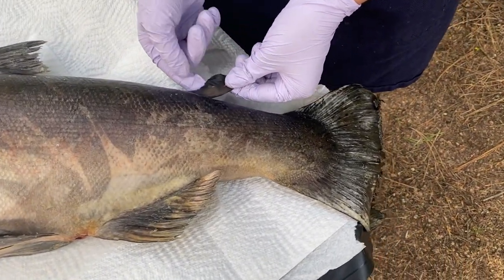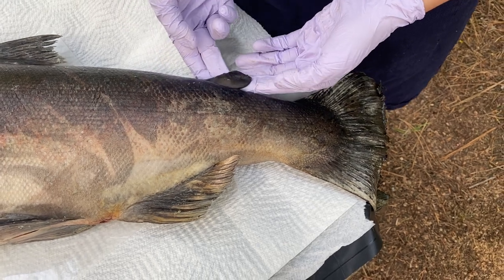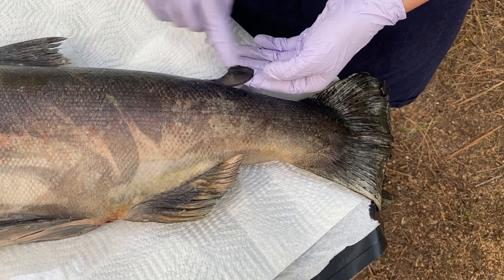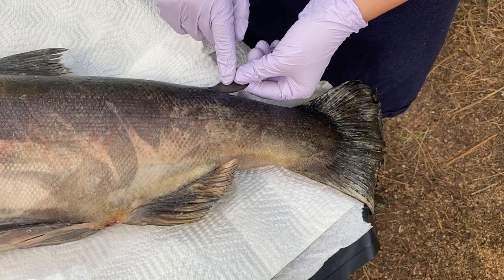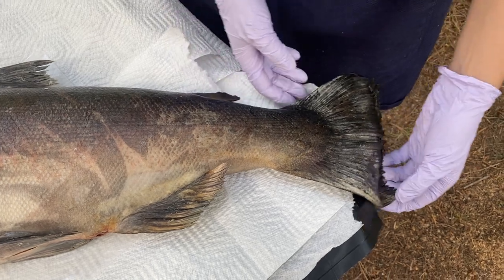And then we have the adipose fin, which they use to identify if it's a wild run fish or a hatchery run fish. And there was a purpose for it. So it does function, it does have a purpose. In really, really fast waters, they can use this fin for a little bit of direction, but waters haven't been that fast in a really long time, so they don't really need it anymore.